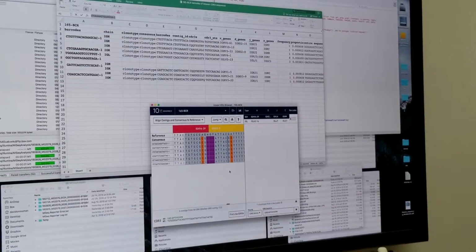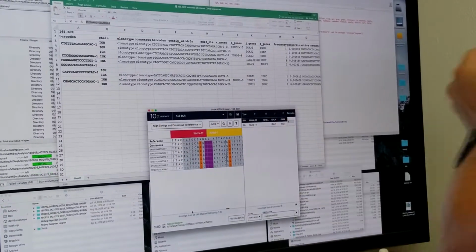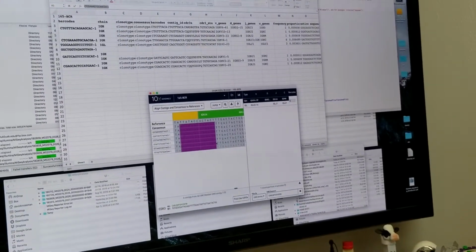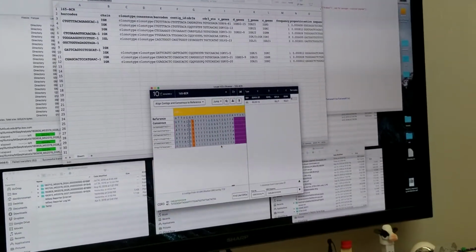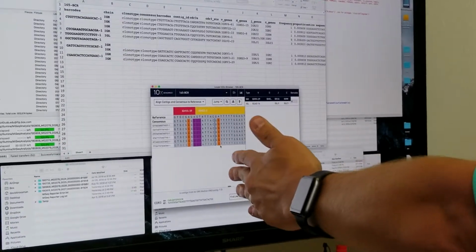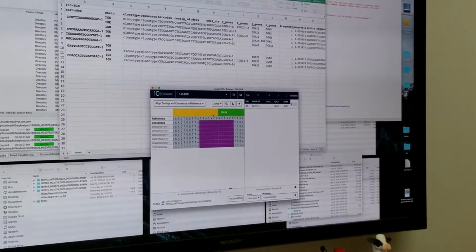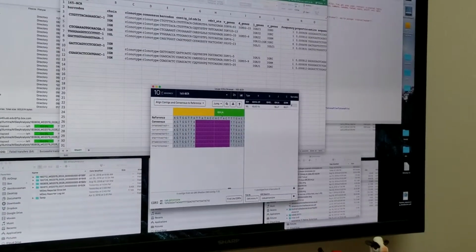Is that the D region? Yeah, so this is CDR3. CDR3 starts about here and rolls into that. I see. And then you have this large deletion here. So the CDR3 region's in this dark gray area, so there's a big deletion again. So you have a deletion at the beginning of 3 bases, then an insertion, and then a deletion. Is that between the D and the J? Is that what it is? Yes, that's correct. If I scroll back, this is the D3-3, and here's the J4.